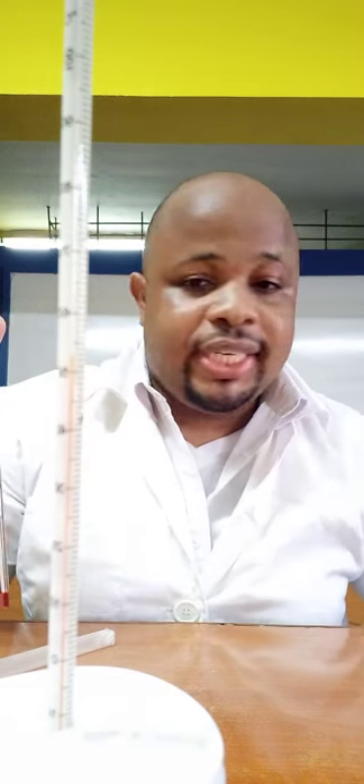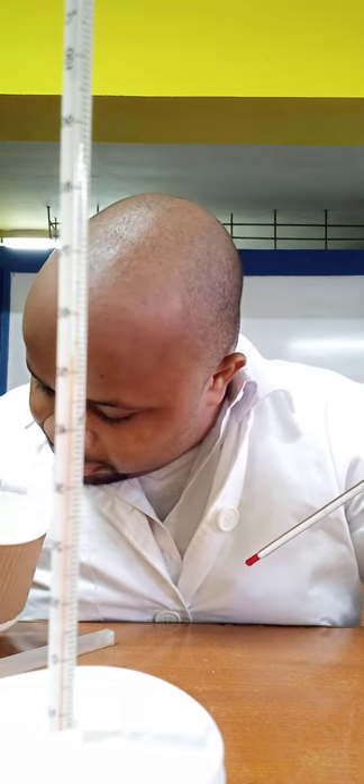The purpose of this experiment is energetics. One of these reactions is exothermic and one is endothermic — I showed you both. The first one with sodium thiosulfate: initial temperature of the water was 26°C; after adding and stirring, it was 23.5°C. It's clear that the temperature decreased, meaning heat was absorbed — so it's an endothermic reaction.